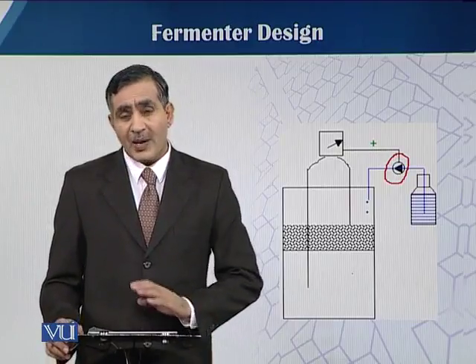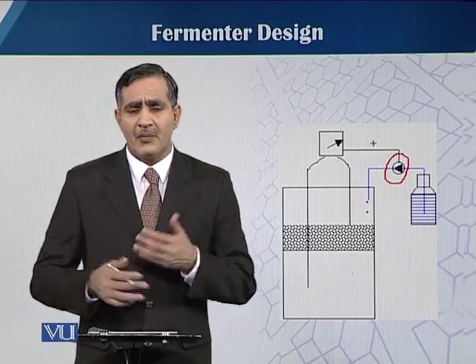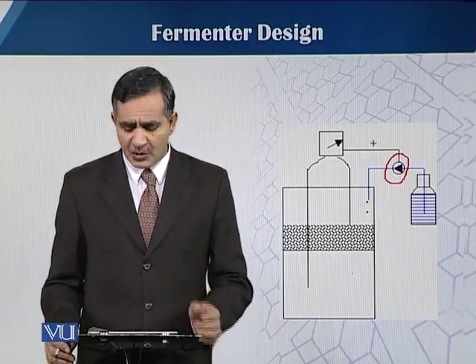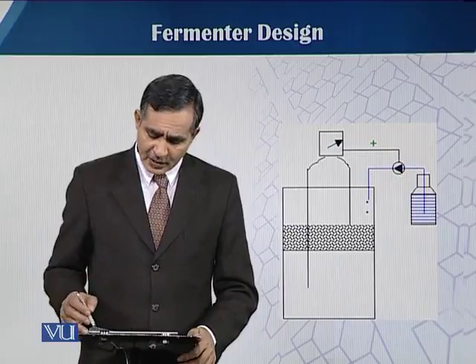So we have to be very careful about foam control with the automatic control system. This is a limitation while using the automatic anti-foam control system.